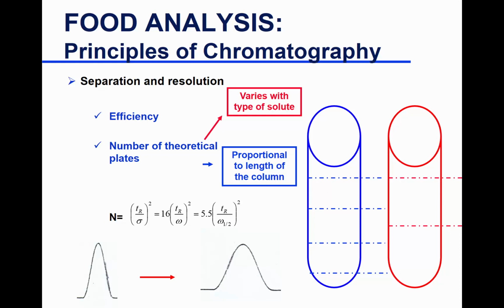So your number of theoretical plates decreases, meaning the efficiency of the column decreases. This leads to wide peaks because you have more diffusion within the particles of the column, rather than a nice sharp peak. The broader your compounds, if you have multiple compounds, the more they co-elute, versus here they are separating and remain sharp.